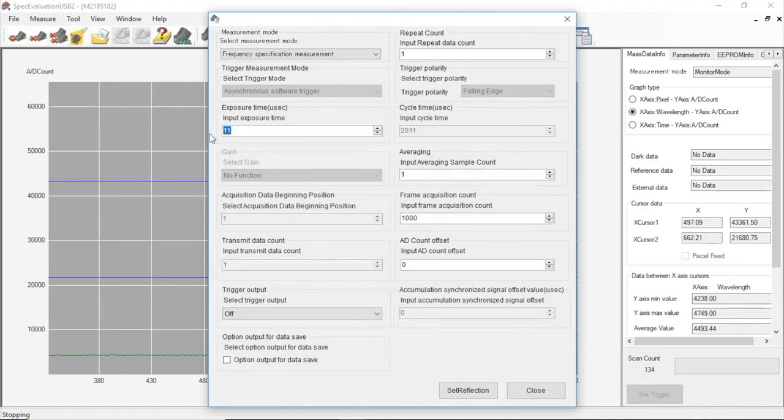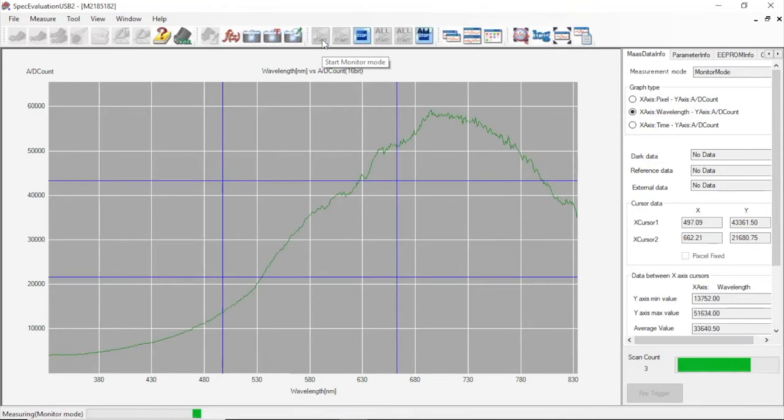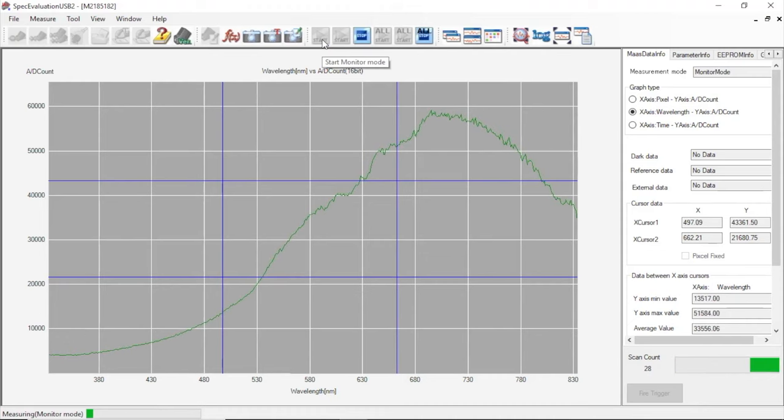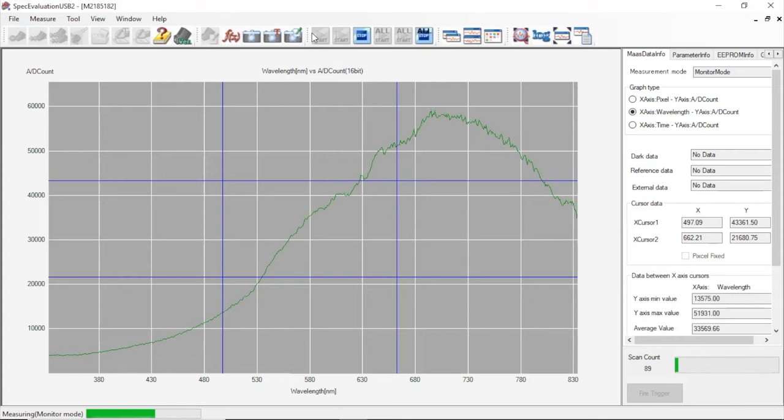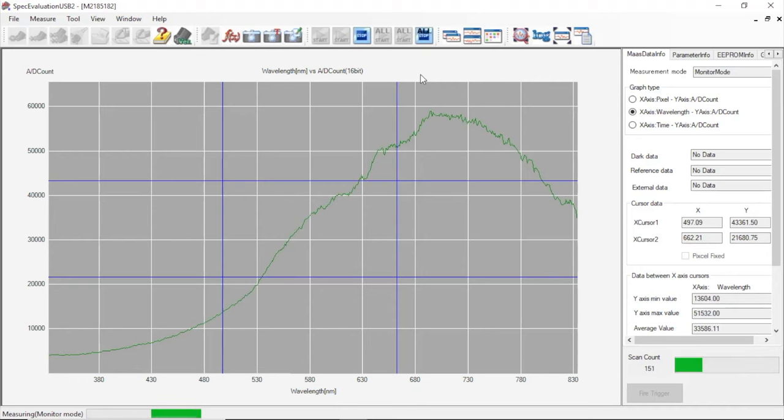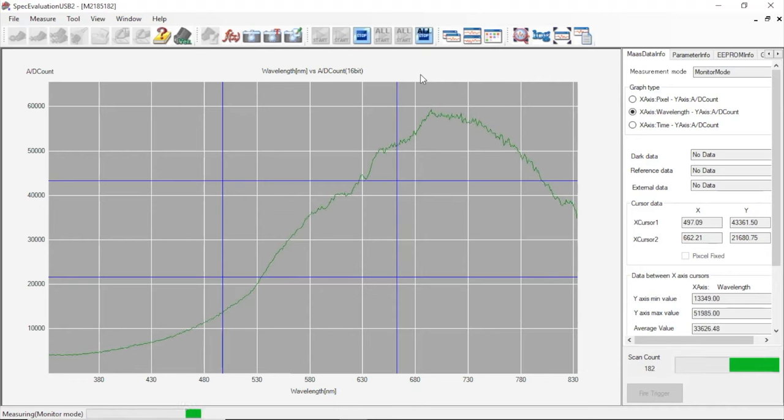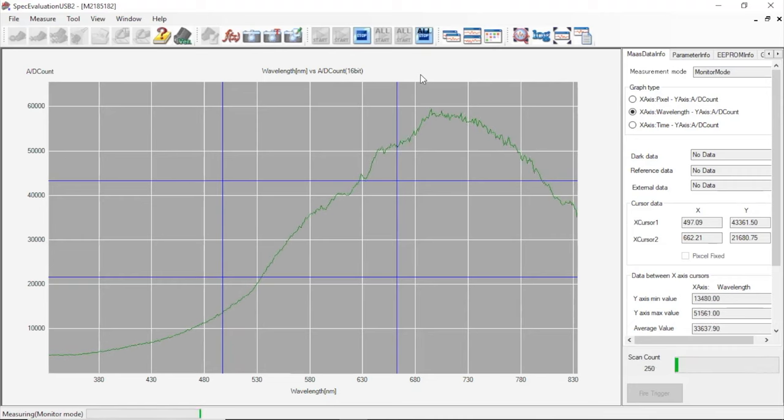We can adjust this value by changing our integration time. So we'll adjust the integration time for 1300 microseconds this time and see what kind of plot we get. So that looks much better. The goal here is to maximize the amount of light the sensor can detect without hitting the saturation point of the readout electronics. This spectrometer has 16-bit resolution, so it's capable of outputting counts up to around 65,000 A to D counts, and we can adjust the input to get around that range to saturate the sensor without saturating the electronics. One of the telltale signs of saturation is a flat line at around 65,000 A to D count mark.